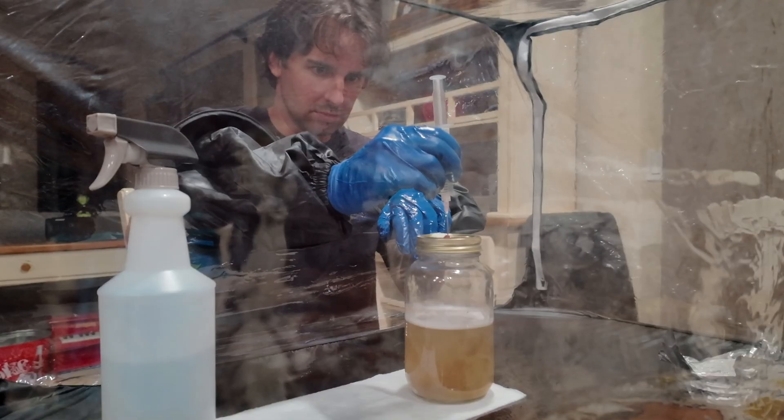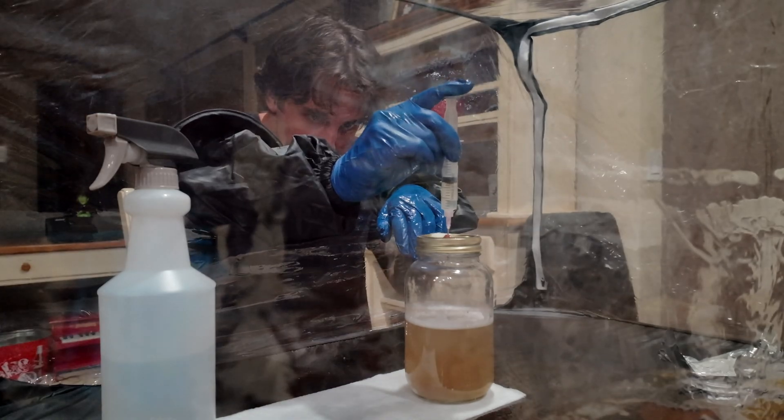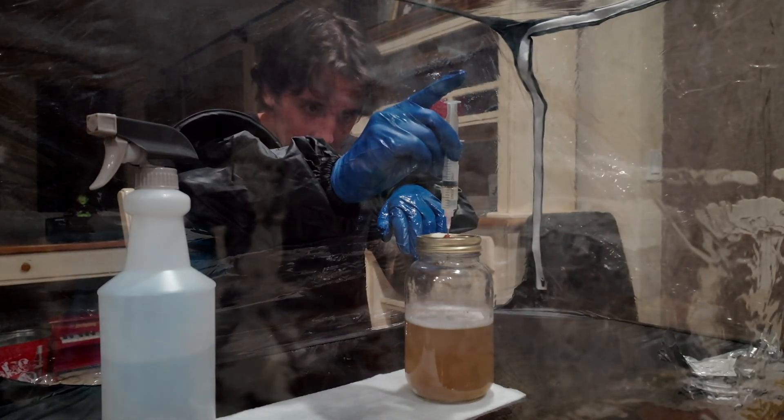Today we're going to turn one $30 liquid culture syringe into hundreds or even thousands of dollars worth of liquid culture. And the cool part is it's super cheap and easy.